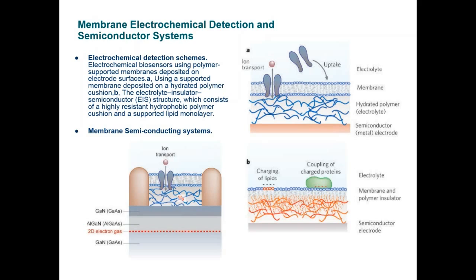So that shows you that this type of measurement is very sensitive to that surface interaction. And in this case, as shown in this image, this can be done by providing a polymer insulator, quote unquote, which provides a soft landing for the membrane against the hard surface.